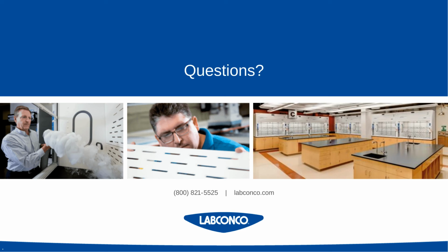Thank you, Kasey. We want to thank our audience for all these amazing questions that are coming in, and we're just going to keep going with them. So our next one, are the filters used for ductless hoods recycled through a Labconco program, or are they to be disposed for incineration?